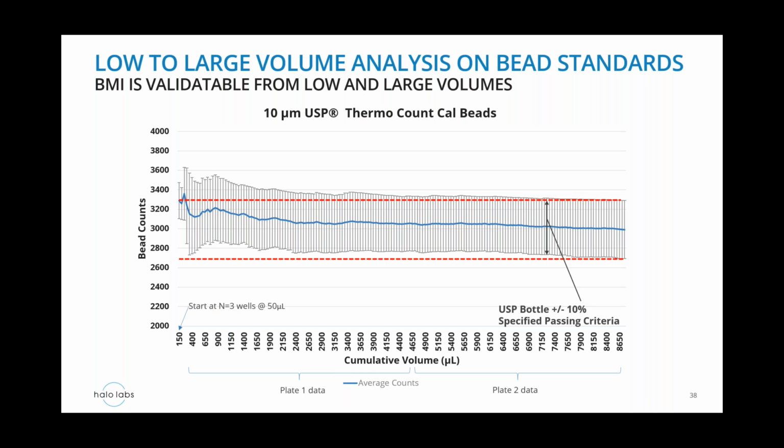Again, this is just a phenomenon for beads where we need to do this aggregation and division procedure. Essentially, the tool counts the right amount of material there, and it's a very powerful tool to truly understand how much material I have in there.